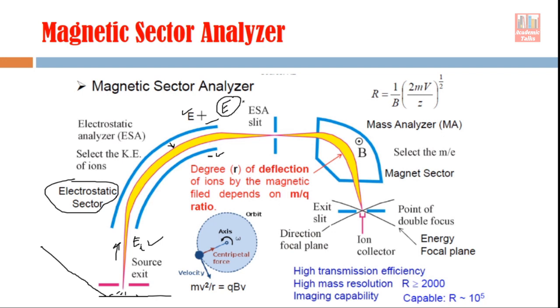And now once you have set the energy of the secondary ions, you can calculate their velocity also, because this velocity will be calculated using this formula. E is the energy, and this energy is equal to the kinetic energy, half mv square. m is the mass of these ions, right? So now you know how much is their energy, or you can say how much is their velocity.